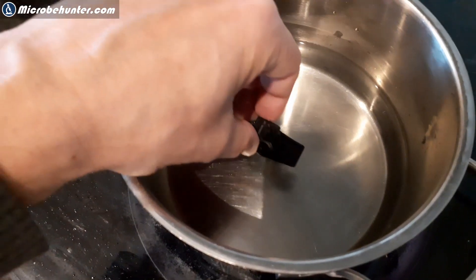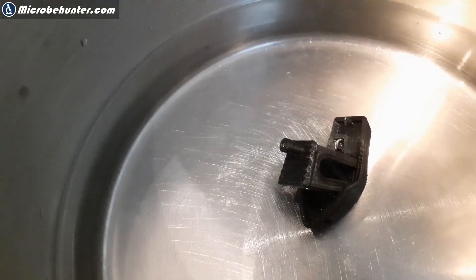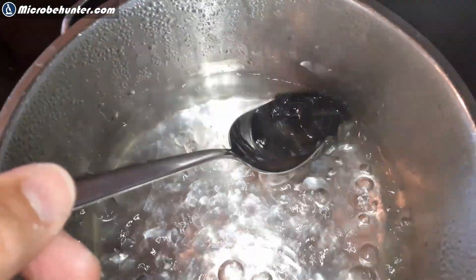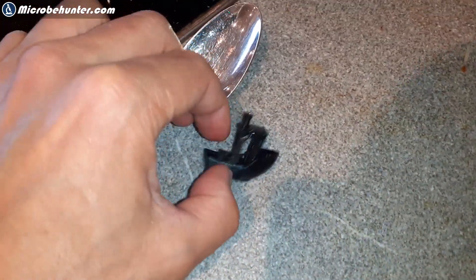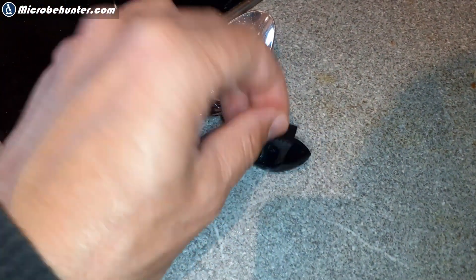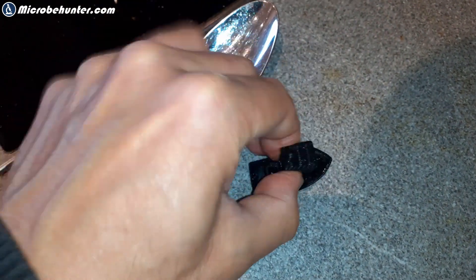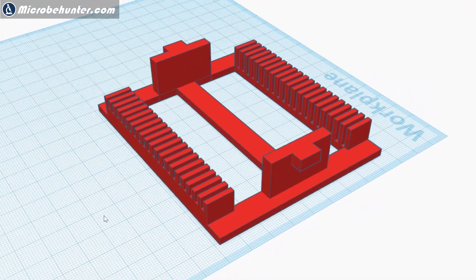Before starting the 3D print project, I wanted to test the plastic because I wanted to know whether it is sufficiently heat resistant to withstand the dishwashing process. So I put a little plastic boat made out of PLA plastic into boiling water, and it was sufficiently stable — it stayed hard and did not turn soft. PLA plastic melts at around 200 degrees, so I decided to just start designing the slide tray.